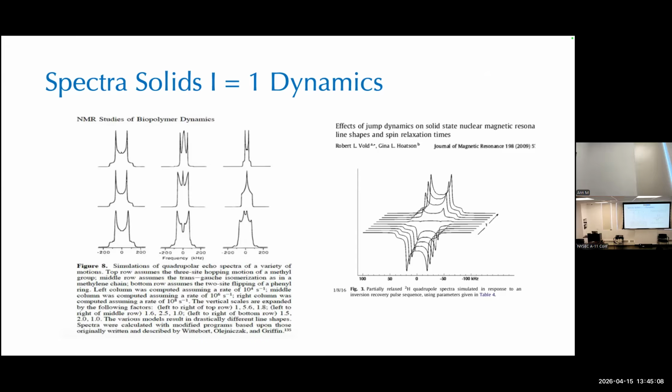In an ideal circuit, the Q is related to that combination of three numbers, the R, the L, and the C. I'm sorry, I don't have it. I'm not going to do a good job of it from the top of my head, but you can look at that combination. So inevitably there's lossiness in that.